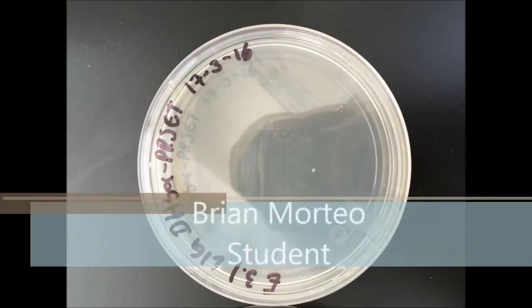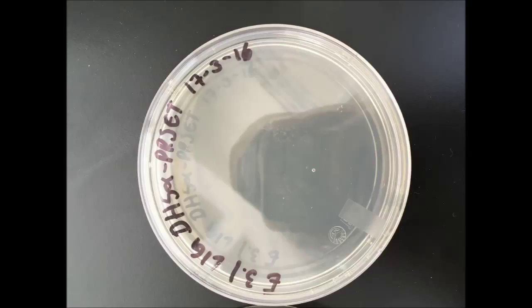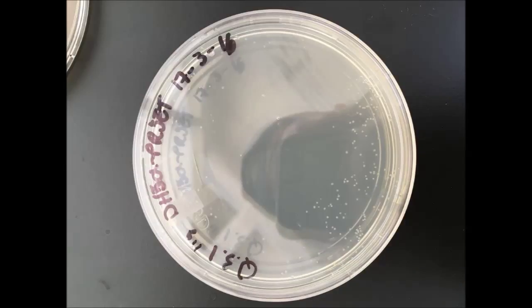In the petri dish of the electroporated cells, we could observe no growth, while in the petri dish of the chemically competent cells, we could observe the growth of 234 CFUs after 17 hours. The transformation by electroporation did not work, and this could have been because the voltage was not adequate. It could have either been too low and it did not transform the plasmid, or too high and it killed all the bacteria. The chemically competent cells gave a higher yield, but it was still relatively low.